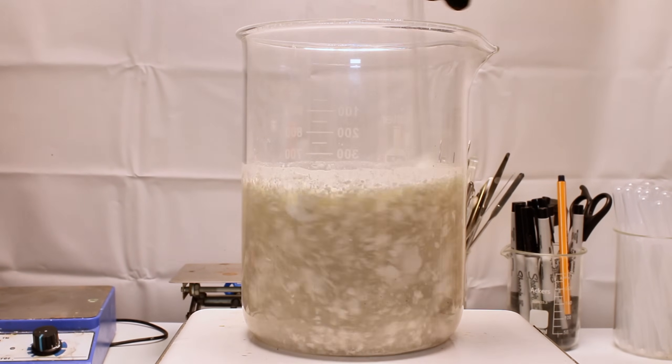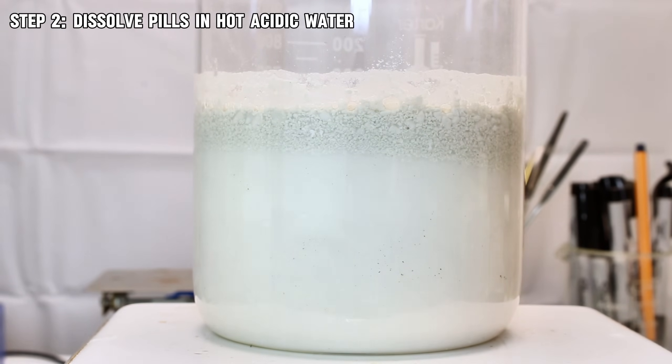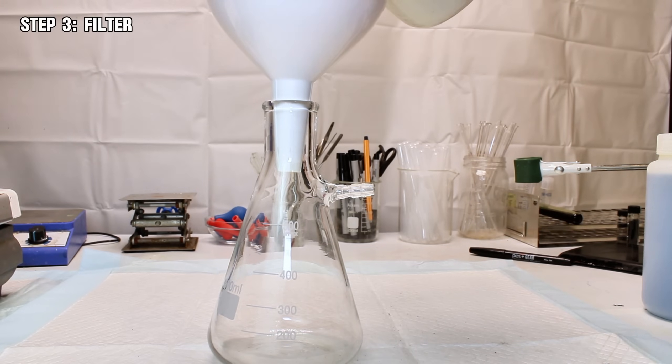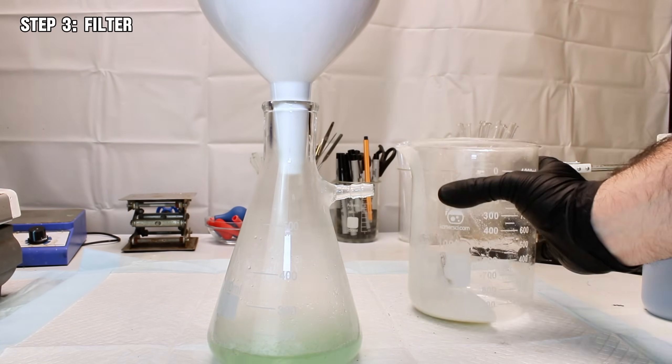Once the pills were finally ground, I then thoroughly mixed them with a few hundred milliliters of distilled water that I'd balanced down to a pH of 1 in order to dissolve as much iron sulfate as possible. This was then passed through a coffee filter to try and remove the filler materials from the pill, which from what I can tell is mostly cellulose and calcium phosphate.